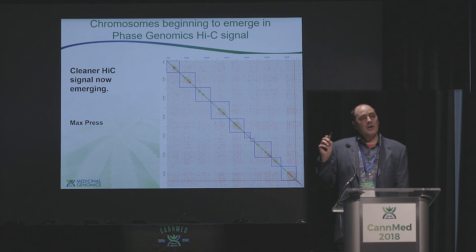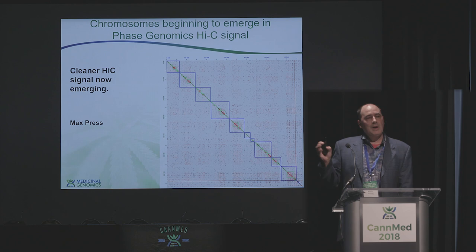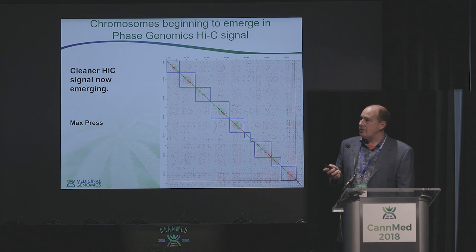Now, there might be a couple of gaps in between the scaffolding from Hi-C, which we can fill with a couple of other programs that they're recommending, like Pilon and another tool that helps to connect those. I think it's called PBJelly. And we're in that process right now to polish these things and fill the gaps, but I think it's safe to say that we now have a genome that is better than most of the other agricultural crops out there.